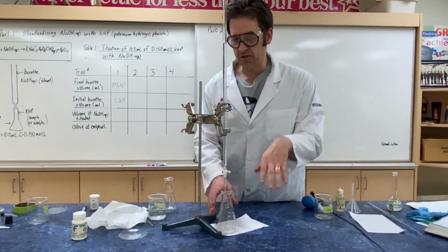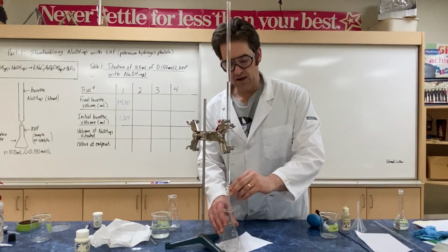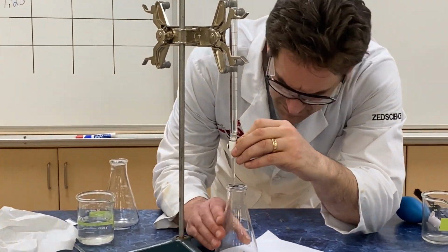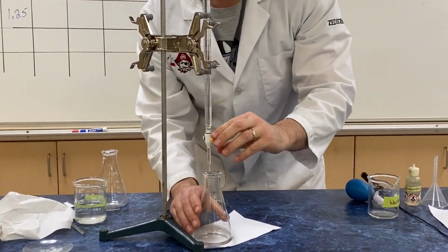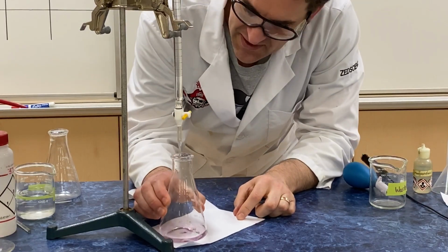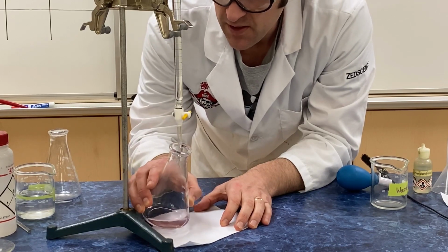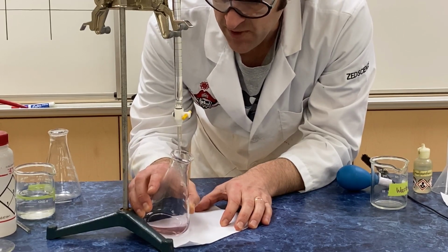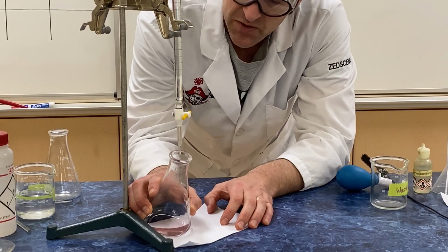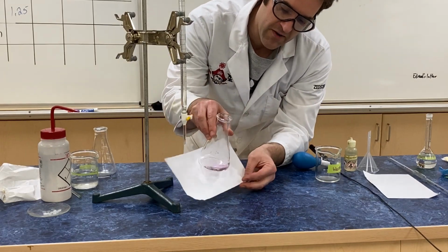Okay, so here we go, round 2. This is going to be fast forward, and I'll show you guys a new technique, okay? If you want to do a half drop, what you can do is touch the side, and sometimes the drop will make it all the way down, and you might have to give it a little squirt of water there to get her all the way down, but this one made it actually, so I don't need to do that, and give it a little swirl, and we can see it's very faintly pink.